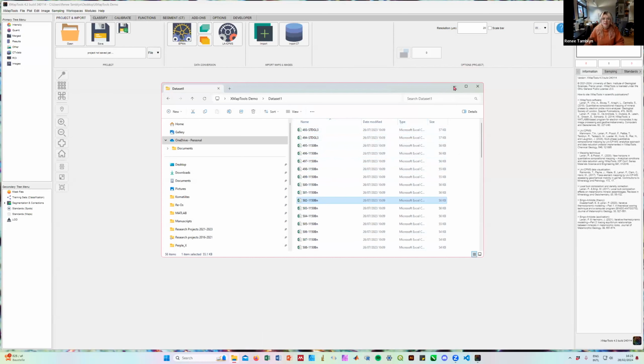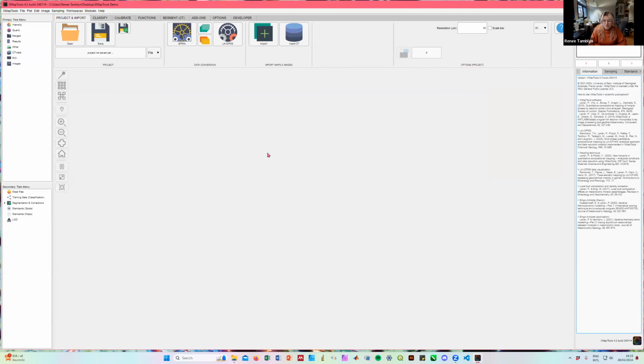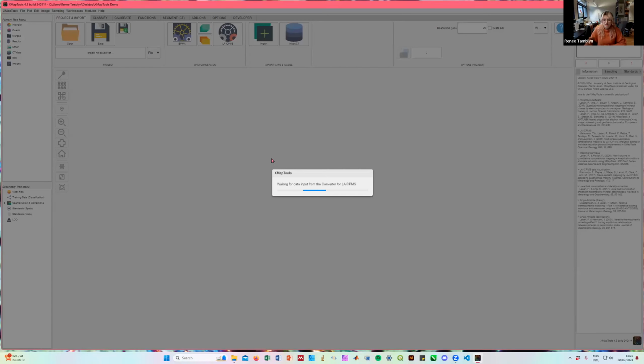And as Pierre also mentioned, sometimes you will not produce this log file that Thorsten used just previously to process his data. So the next version of XMapTools actually has a way of dealing with that, which opens up XMapTools to other labs and other ways of collecting this data. So again, we go back to this converter module that Thorsten showed us by pressing this button up here in the data conversion tab.